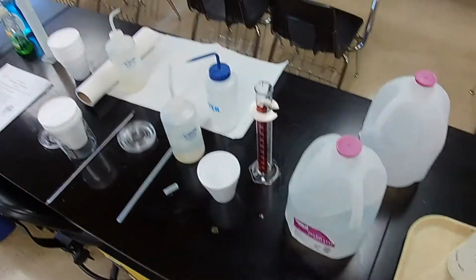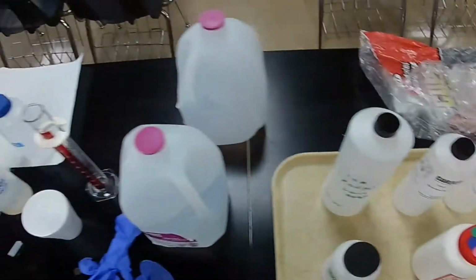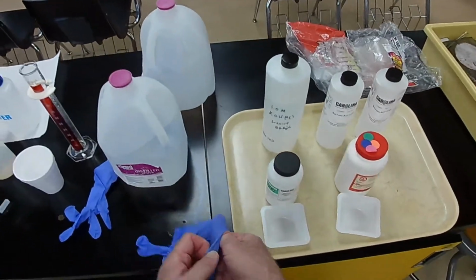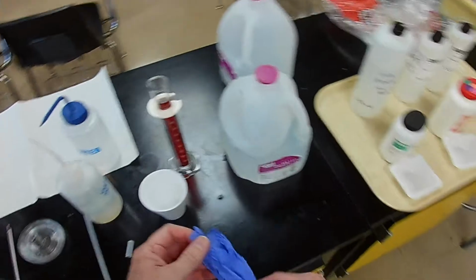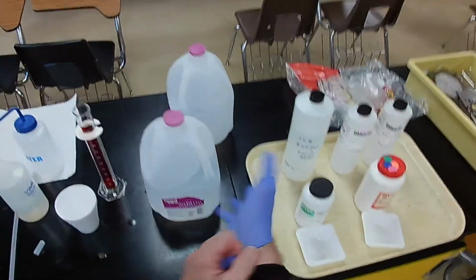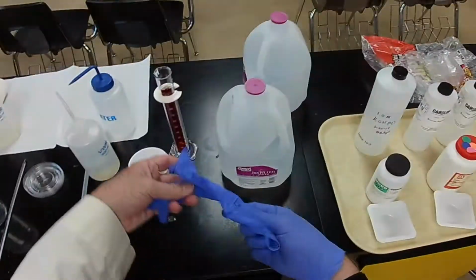We were just using water earlier. That's no big deal. But now we're using acids and bases, and we need better gloves. Can't pull too hard on these things. Now they'll just come apart. Let's try this one.